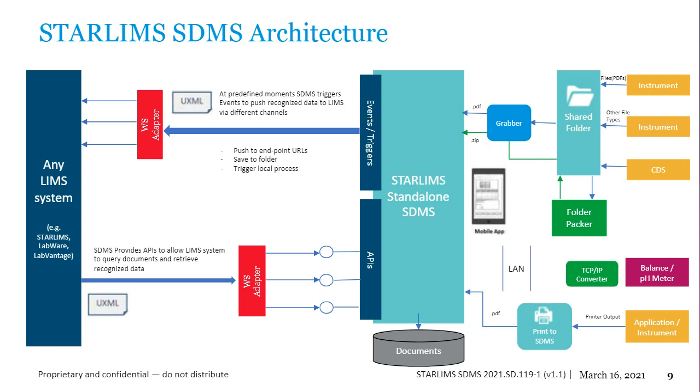And with web services in general, for any enterprise system, our SDMS is a secure system, so it will need valid credentials to be presented with each request for the SOAP and REST protocols.